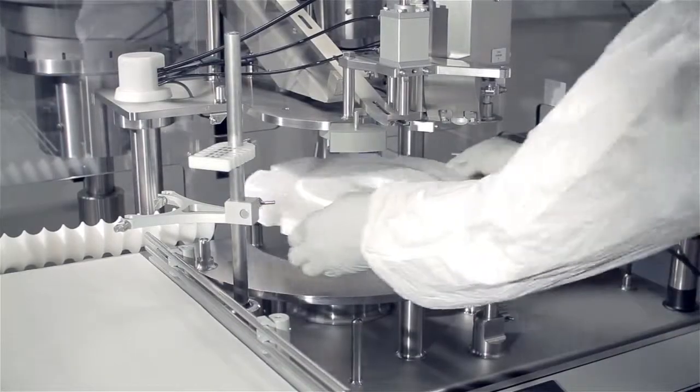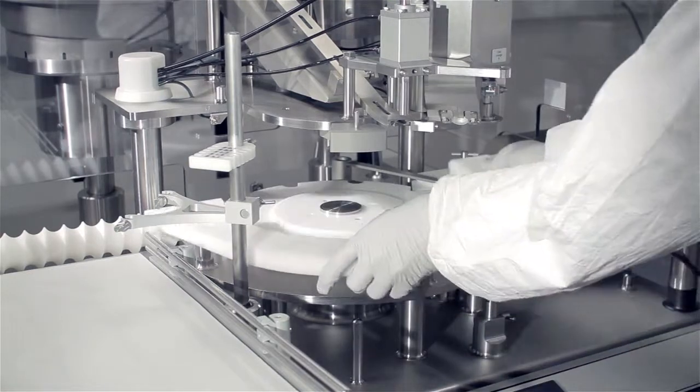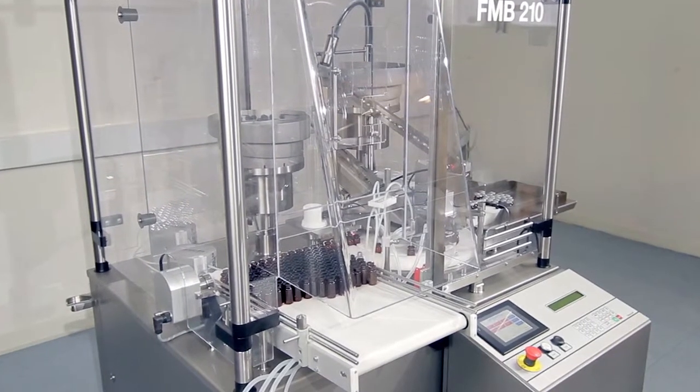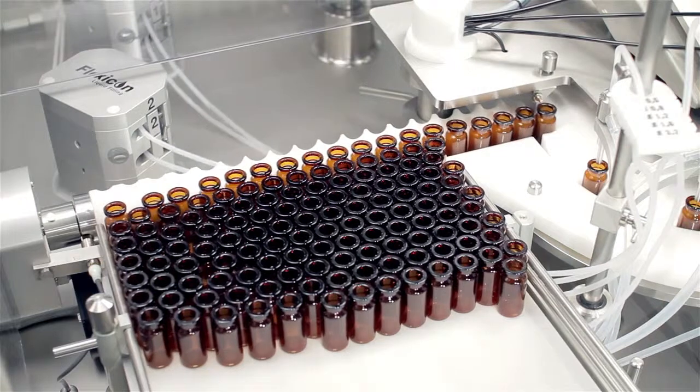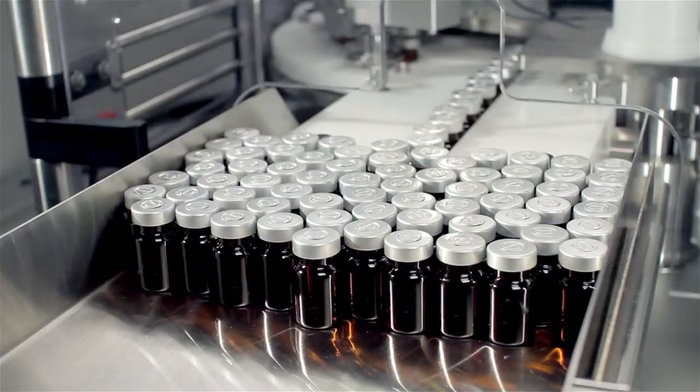A production run can be set up in under 20 minutes and the total capacity per working day is unique for this size of filling and capping solution. The FMB210 is perfect for small to medium sized batch runs. Depending upon fill volume, the machine can process up to 4,500 vials per hour.